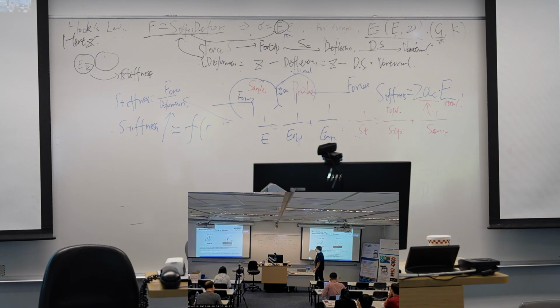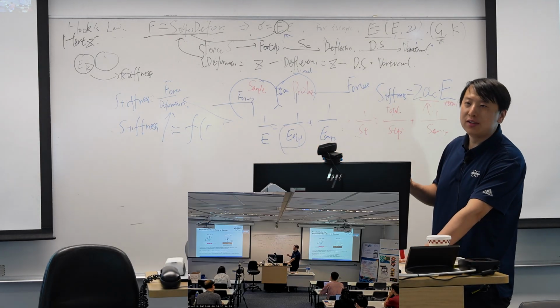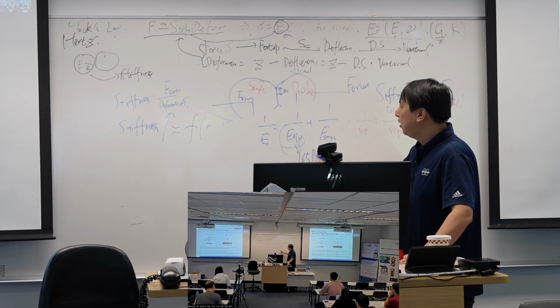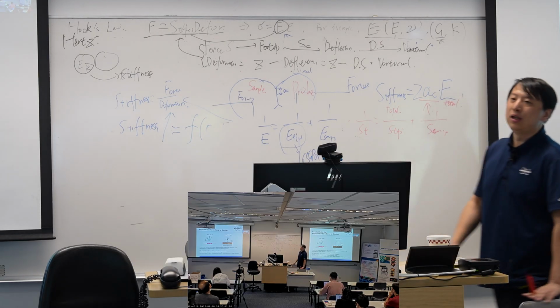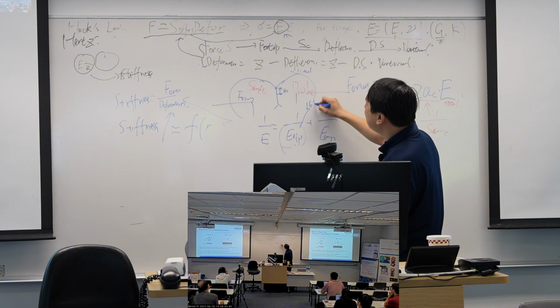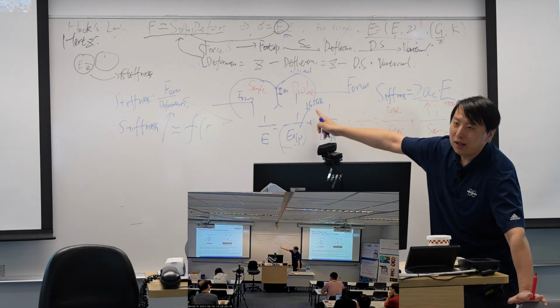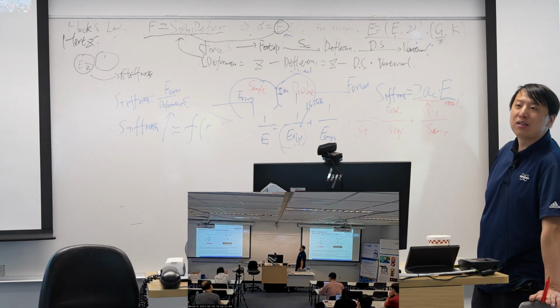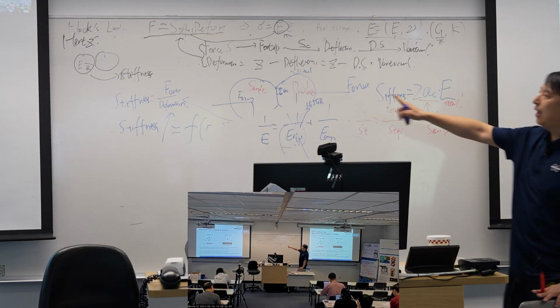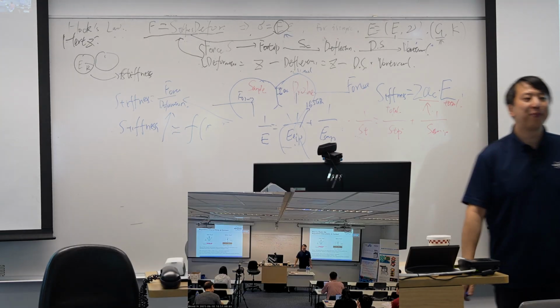And from this step, the modulus of the tip is known because we are using silicon probes. So this one is a large value. The modulus of the silicon is 165 gigapascals. So the probe is quite hard, so we can get rid of this one. So the modulus we get equals the modulus of the sample.